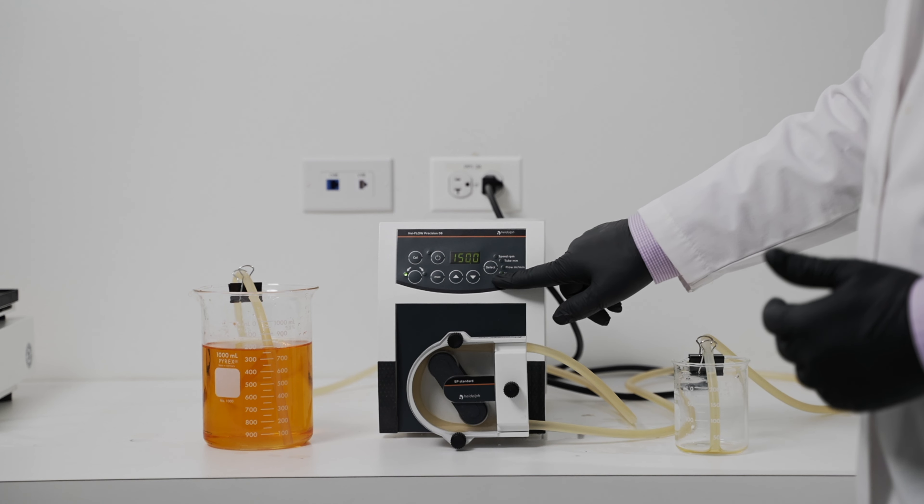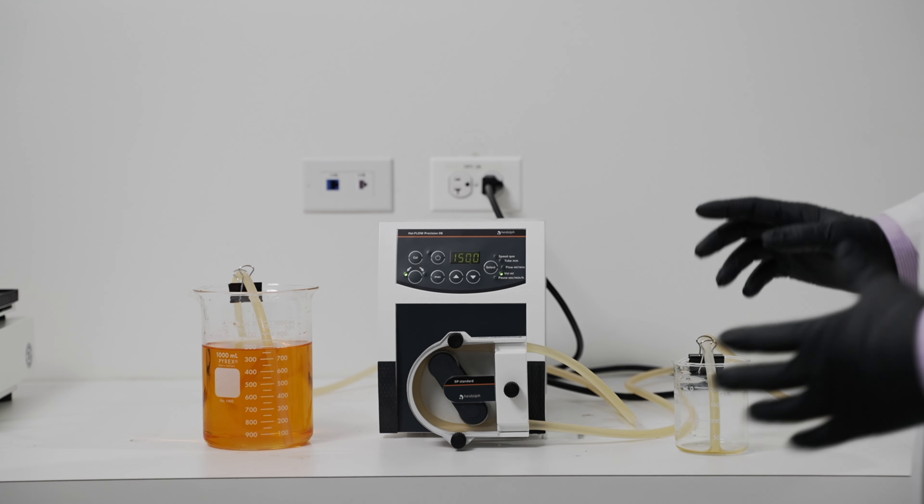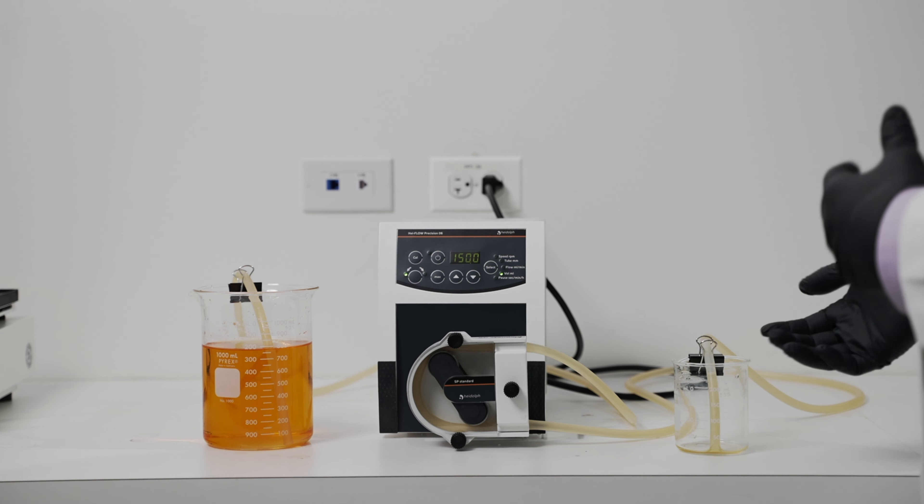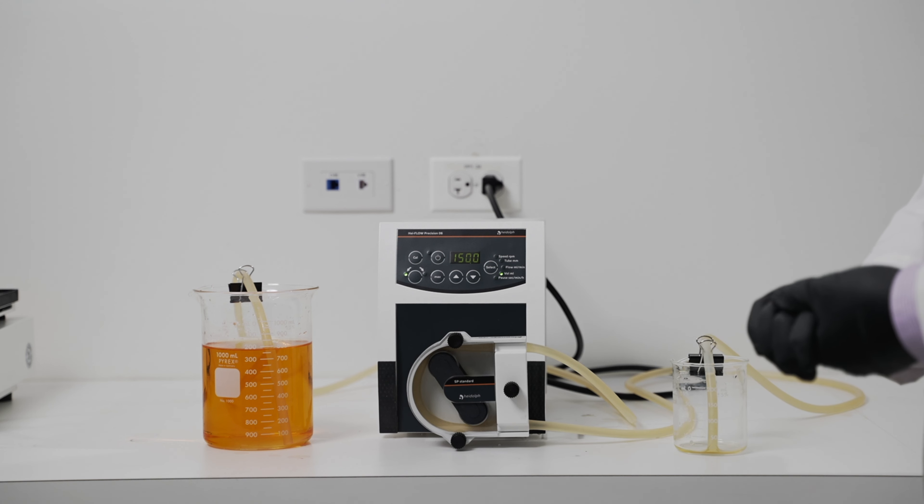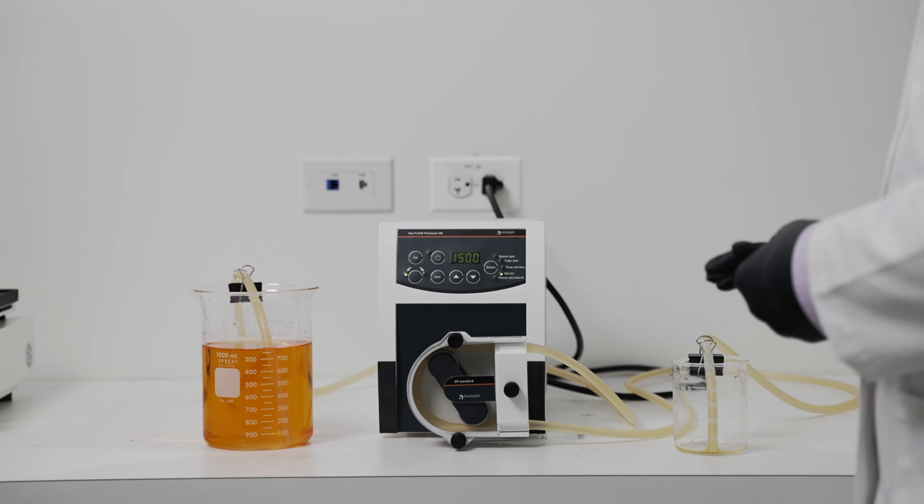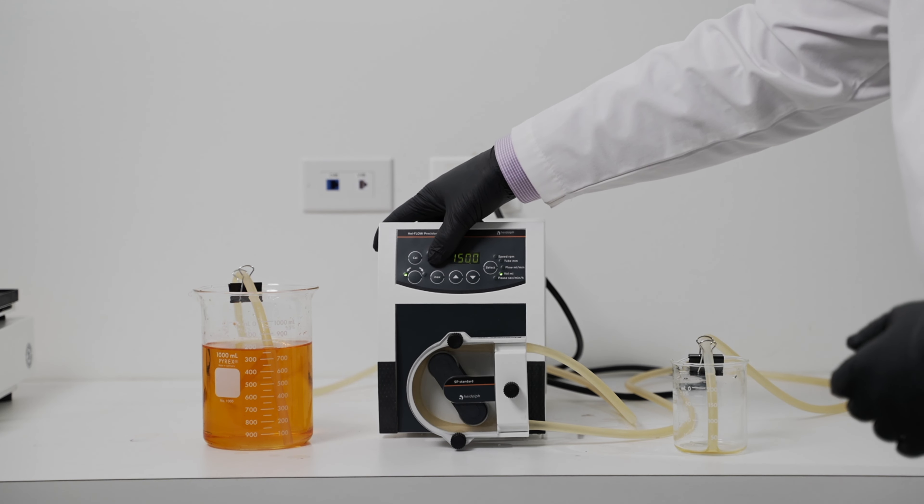To do that, we'll hit select twice to go down to volume milliliter, and you're going to want to set it to a volume that your measuring device can hold. In my case, I've got a 200 milliliter beaker, so I'm going to go with about 150 milliliters of fluid. Once we have that set, we can start that volume dose.